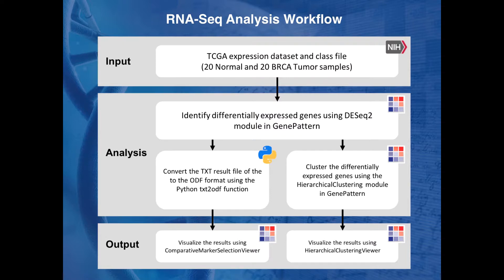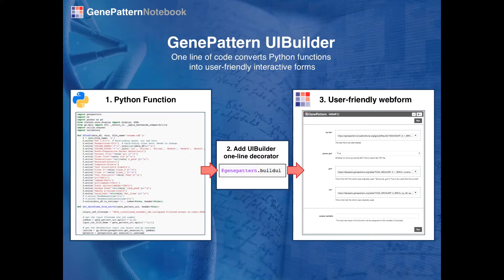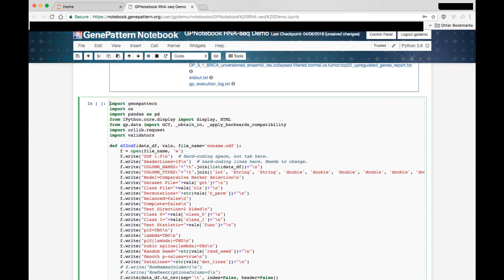To demonstrate the use of GenePattern results in Python, we'll convert the TXT results from our DESeq2 analysis into an ODF formatted matrix of data. This will allow us to view our analysis results in an interactive viewer which requires data to be in an ODF format. We could just run this as raw code in our notebook, as you would in any Jupyter Notebook, or we can wrap our function as a user-friendly web form using the GenePattern UI Builder.